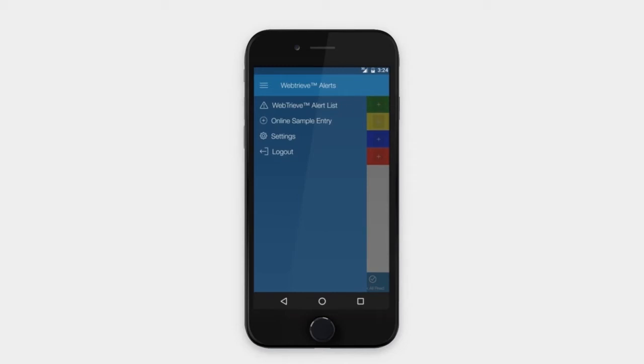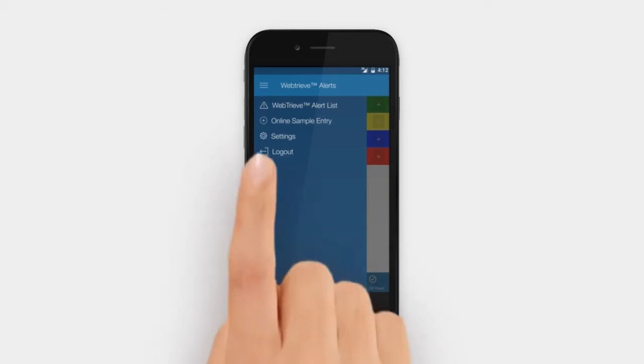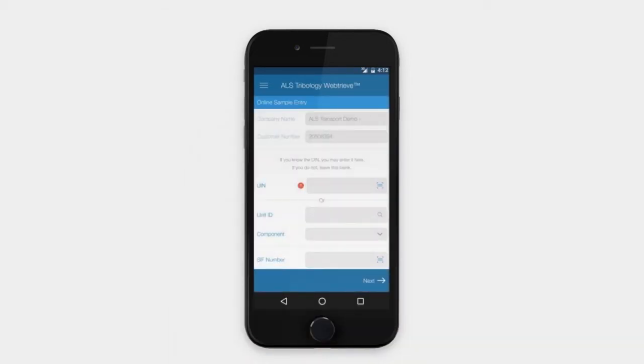You can use the app to submit samples to the laboratory. To submit samples, go to the menu item labeled Online Sample Entry. Your company name and customer number will automatically appear on the screen. Please note that this option is currently available for end users only.